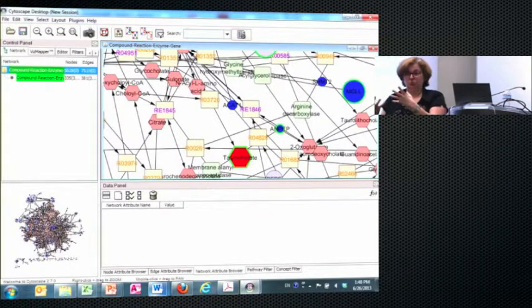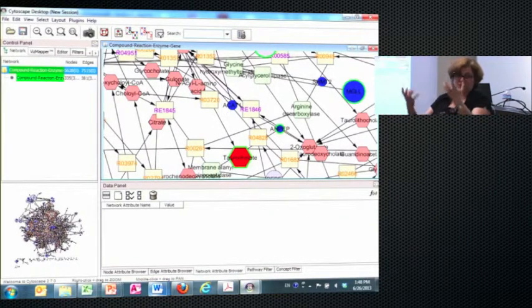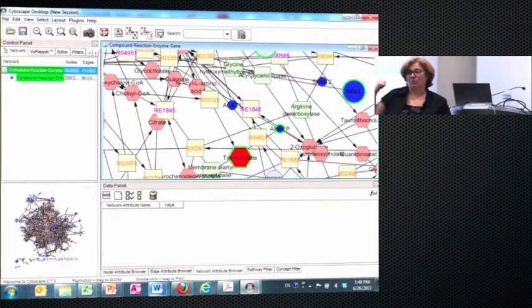And at that point, if we happen to have experimental data for any of these pulled compounds that were pulled out of the database, it will then display that experimental data for them. So it is doing several rounds of checking and validation. I'll show you where experimental data comes from in a minute, okay, when we get to that.